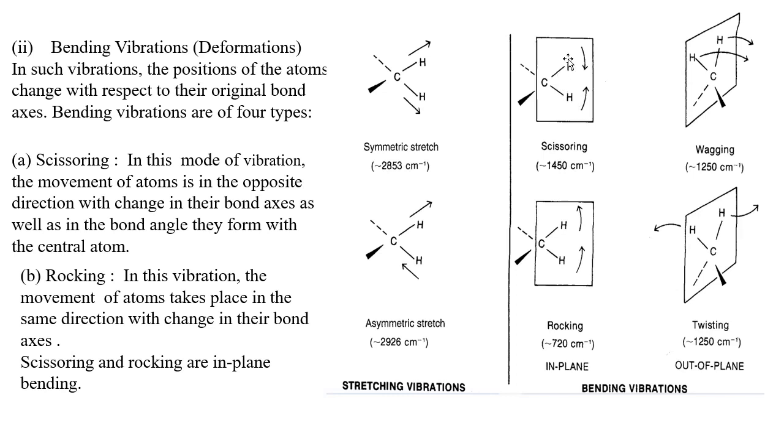You can see here the position of hydrogen changes with respect to the bond axis, the carbon-hydrogen axis.